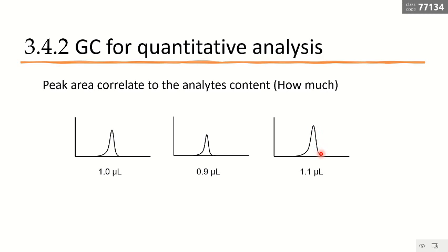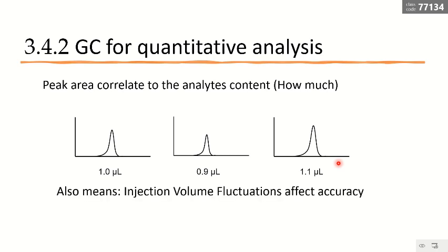If we get this idea, it means if I just use the machine to analyze how big the area is that it gives me, I know how much analyte is inside already. That is how we are going to quantify our analyte. This sounds very good, but it also brings us another worry.